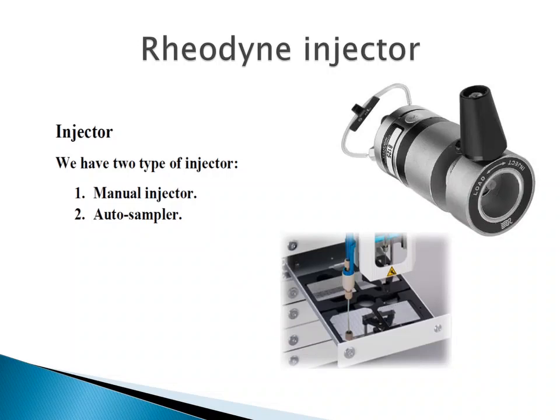Good afternoon, everybody. We will continue to talk about the parts of the HPLC instrument. If you remember, we started to talk about the mobile phase, then the pump, and now we will talk about the injector. The injector is the part in which we introduce the sample.